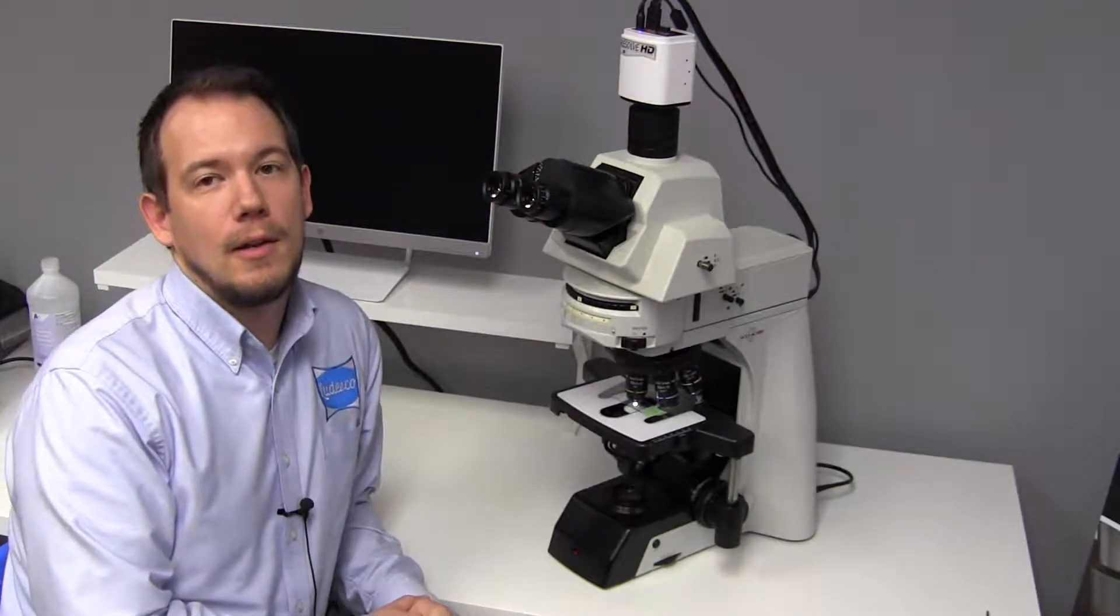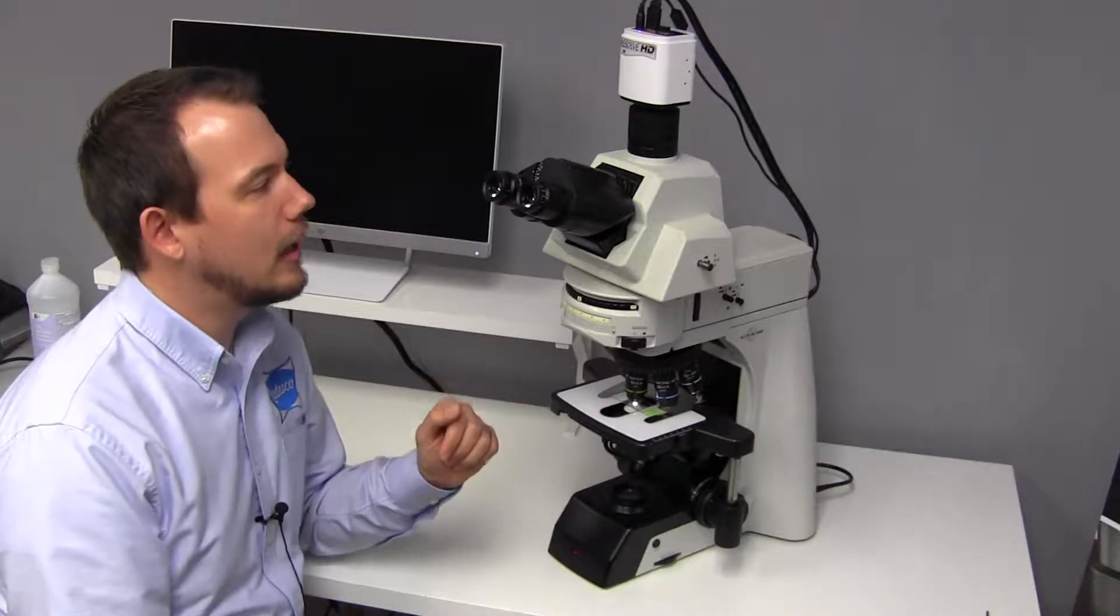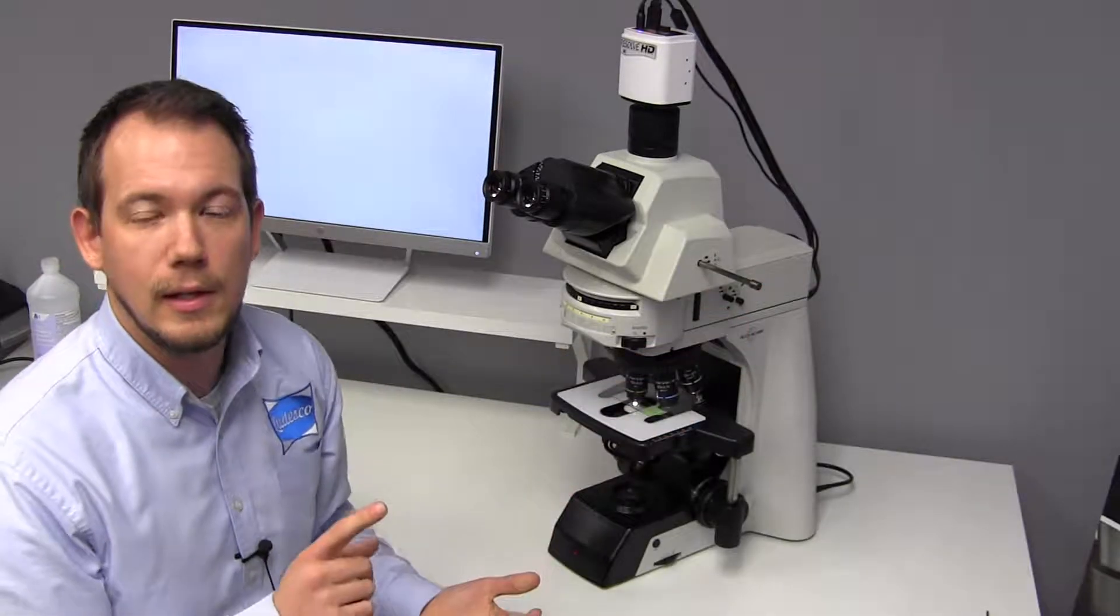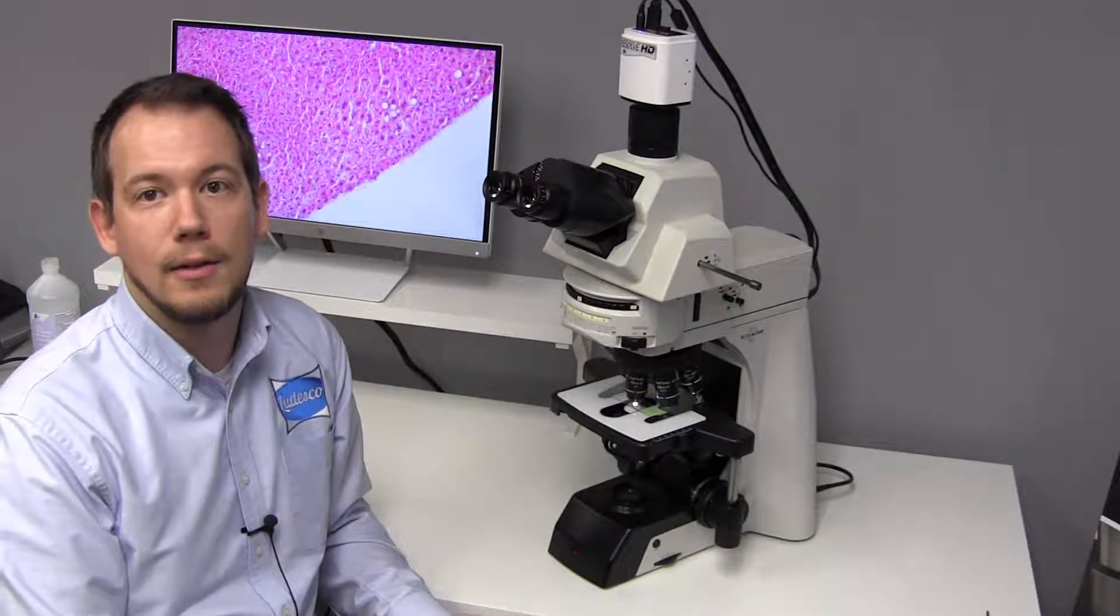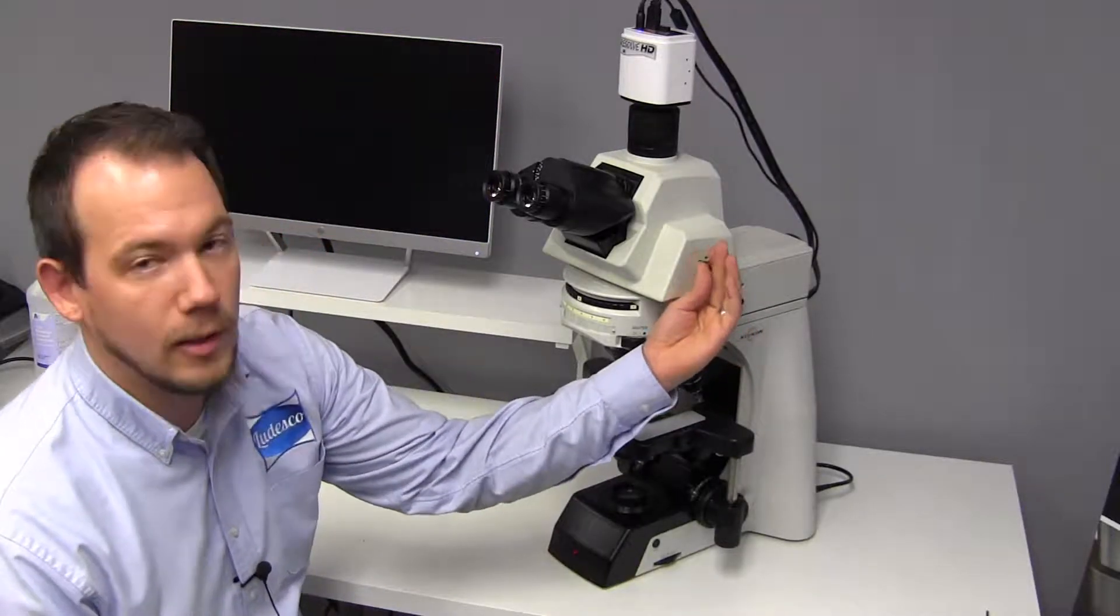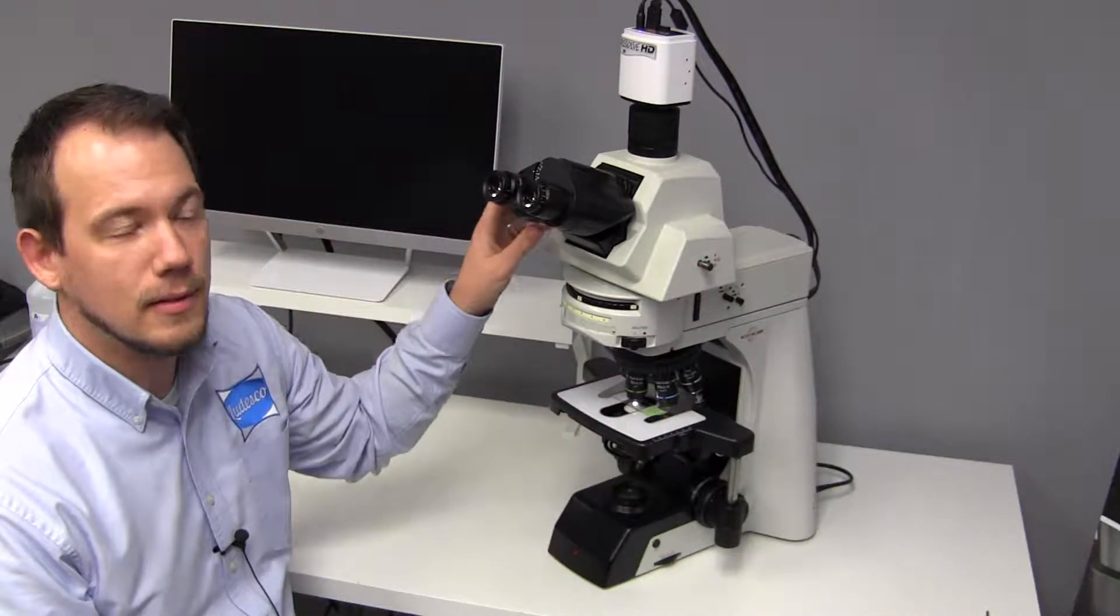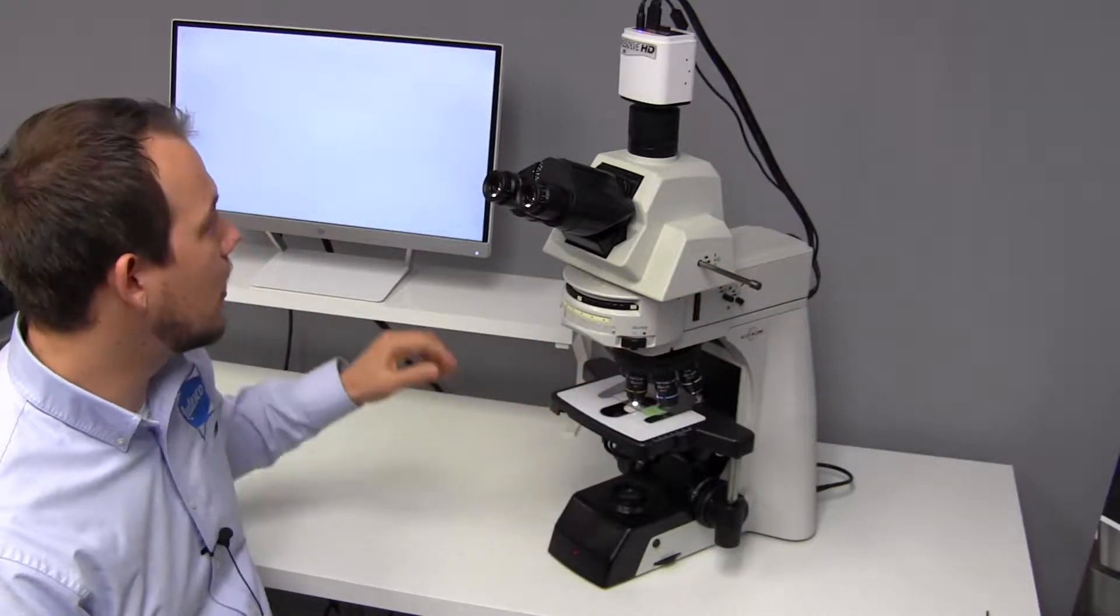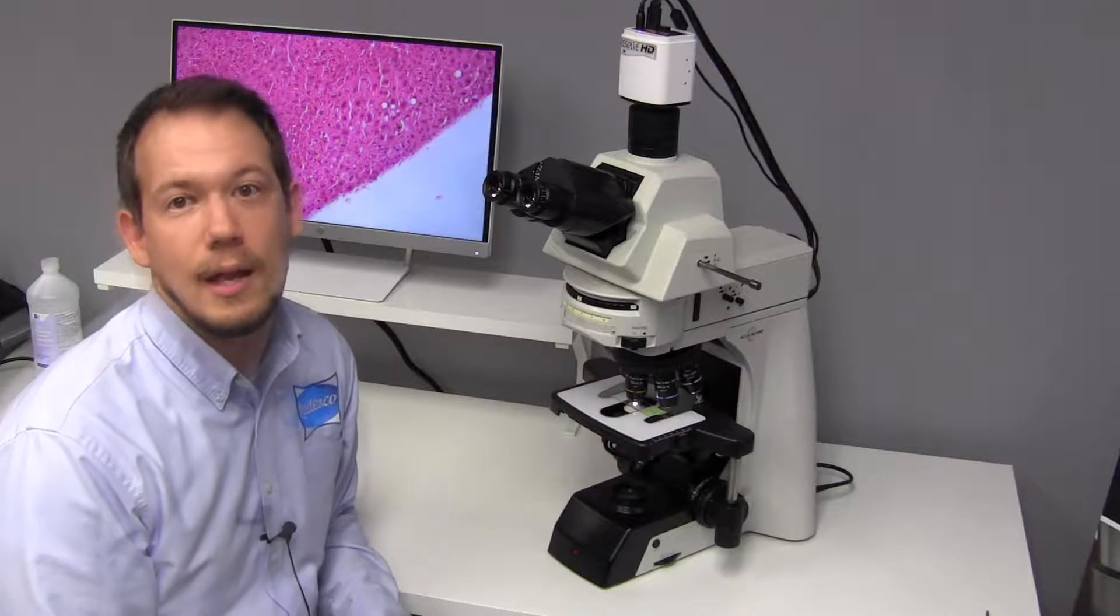If you are using a camera and you decide to go with the trinocular viewing head, there is a three position beam splitter built into both the fixed trinocular and ergonomic trinocular viewing head. The first position being 100% of the light to the eyepieces. The second position would be an 80-20 split and the third position is 100% light going to the camera.